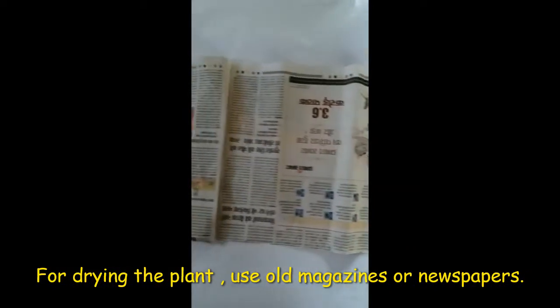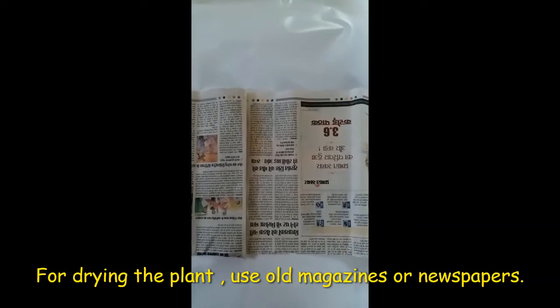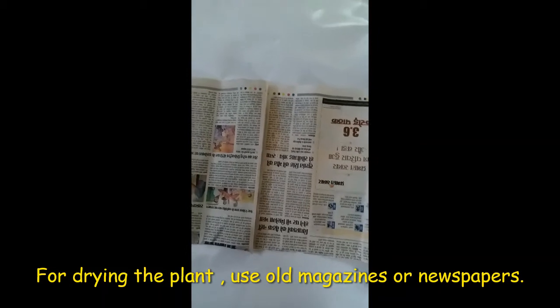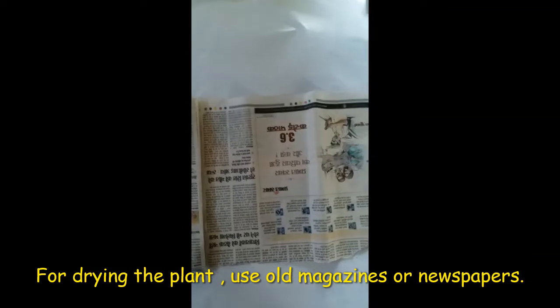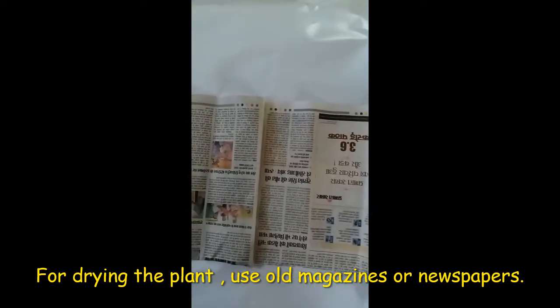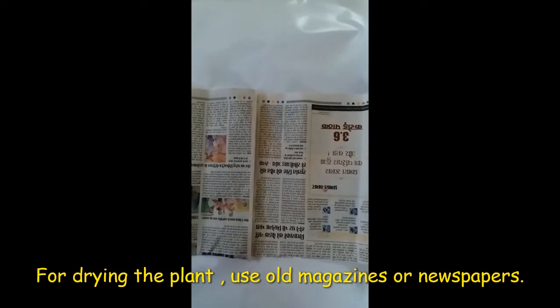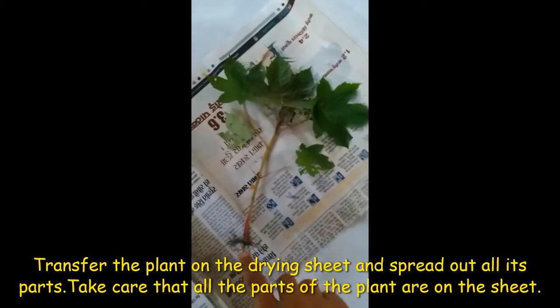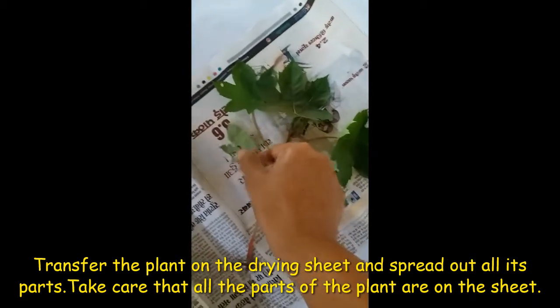Next, take sheets of old newspaper or magazine which have rough absorbing sheets, because on these sheets you will transfer and arrange the plants, then cover them and leave them for a few days so that their moisture is lost and they become well pressed and dried. This is how you must arrange your plant — each leaf should be separated out before it is pressed.